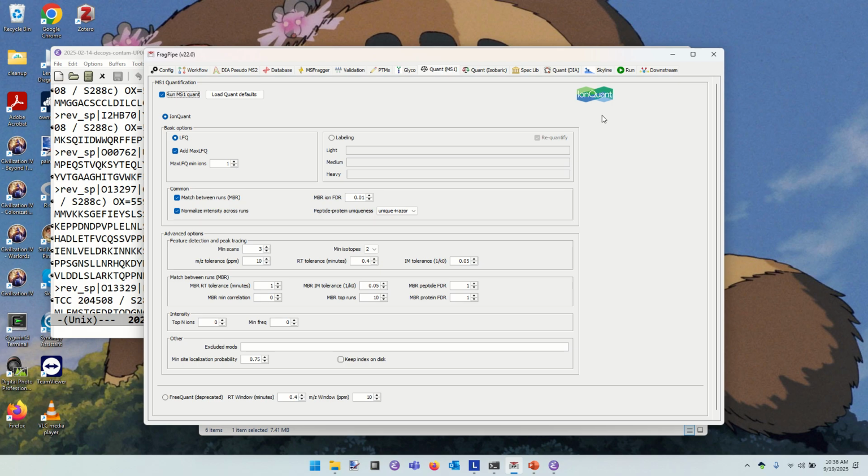Okay, so IonQuant is software that's going to attempt to say how much of this peptide is present by integrating the chromatogram that we see in the MS scans. Essentially, the MS scans are a way to say which ions are coming off the column at this moment in time. A given peptide is probably present for around 30 seconds. So ideally, you will have several MS scans cutting across that allow us to quantify it. Okay, again, we're changing nothing here.